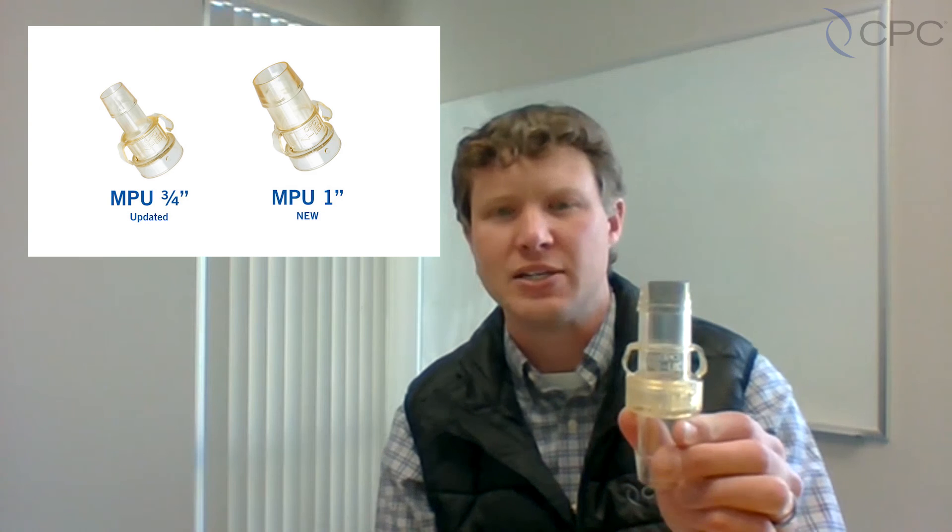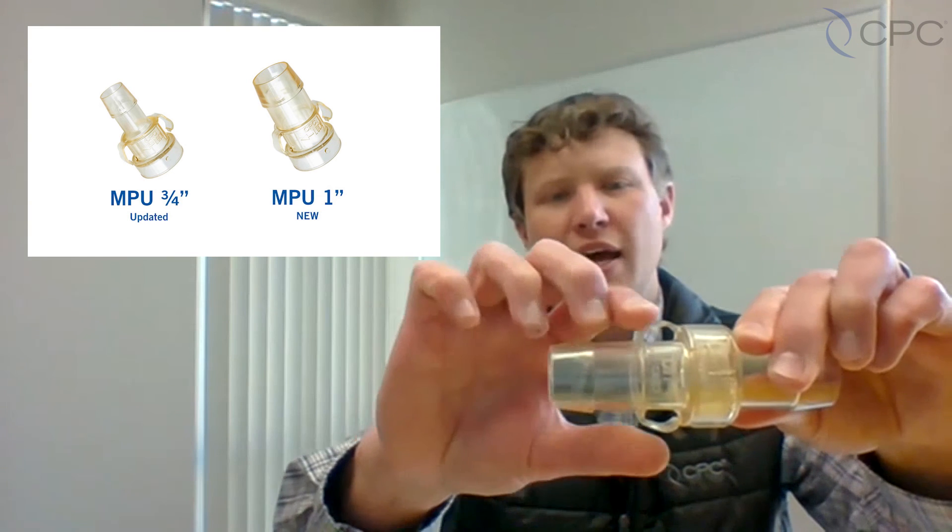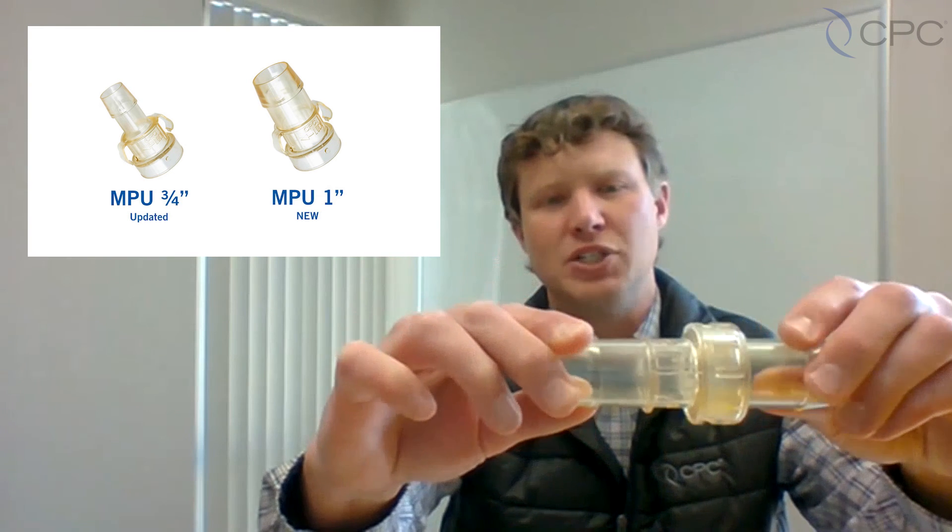The MPU series has a smooth internal flow path, minimizing transitional flow disruptions, as well as locking feature guards preventing an accidental disconnection. In addition, the 3-quarter-inch and new 1-inch size have two side latches to make the connection and disconnection process that much easier.